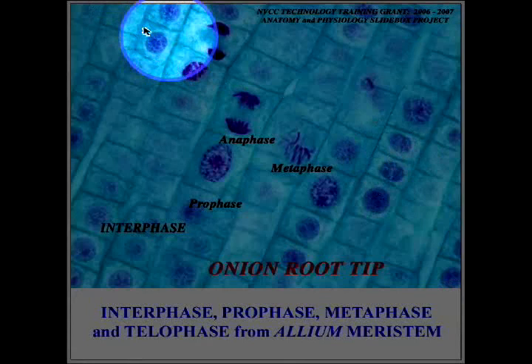If you look around here, you get a general scheme of the variety of what's happening. One of the things you glean from all of this is that you don't have the whole tissue moving in synchrony. You look at different areas and they are progressing at different rates. Some are slightly ahead, some are slightly behind. Some, as we said during interphase, are not even dividing at all.